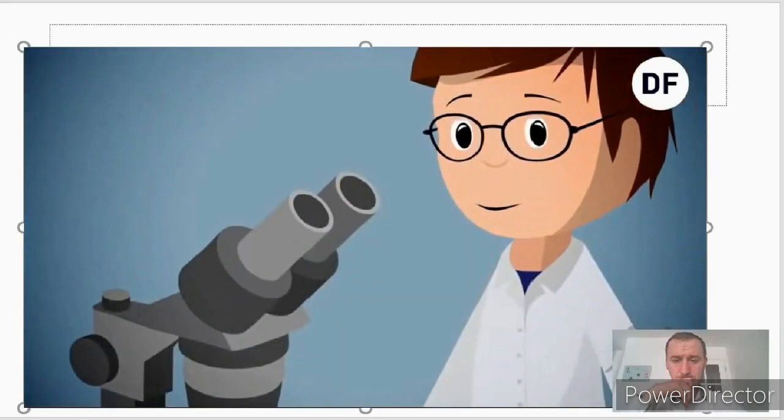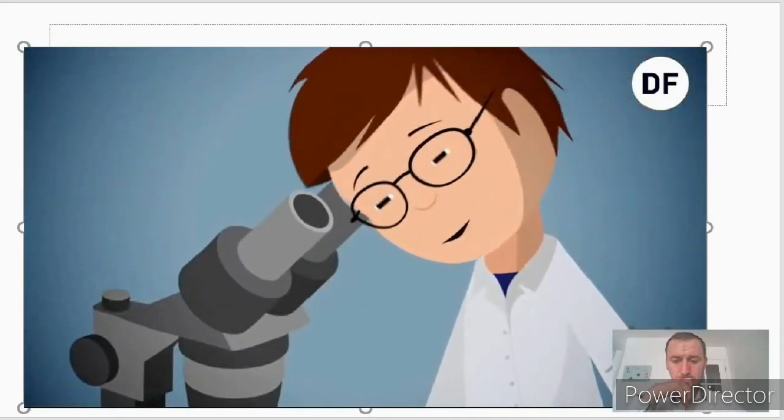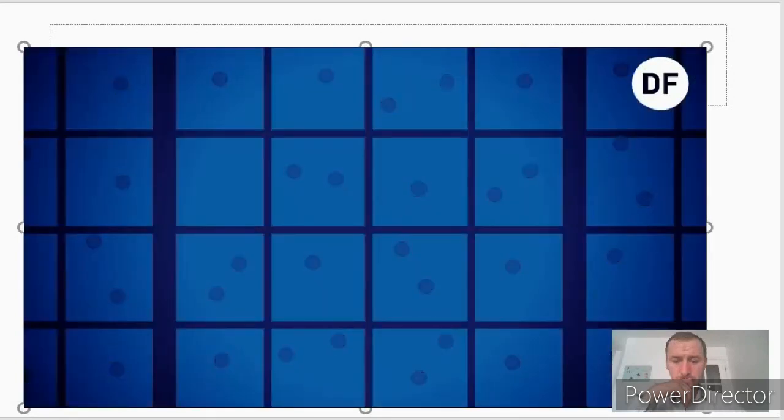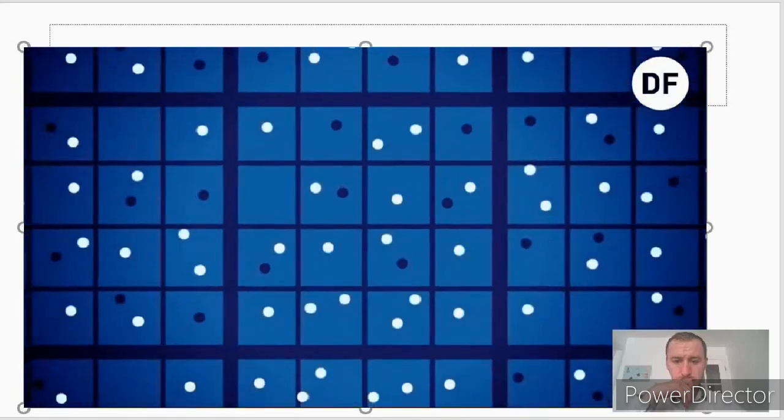With a microscope and a 10 times magnification, you will be able to see approximately 1 square per viewing window. Use phase contrast to distinguish the cells. Live cells will not be stained by trypan blue and will appear white, while any dead cells will be faint or dark blue.